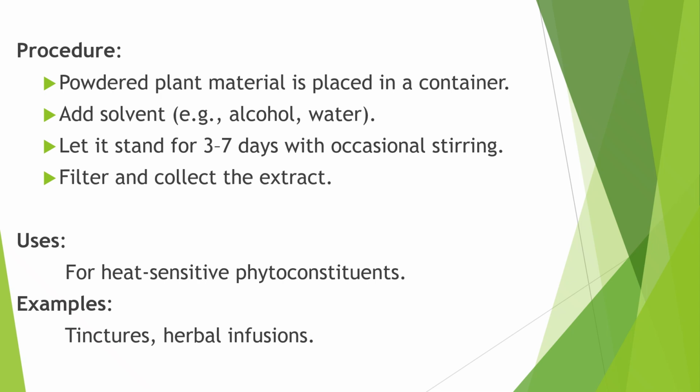First of all, we can add the solvent in a singular way, meaning we can use a particular solvent. In a few cases we can also use multiple solvents. It depends on the procedure, on the nature of the chemical compounds, and on the compatibility of the drug and the solvent, on the basis of which we can easily proceed with the extraction.